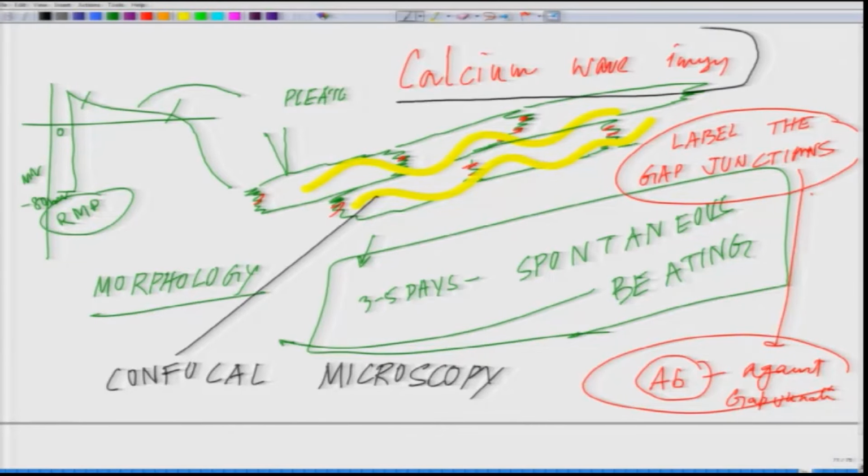So, measuring the calcium wave, these calcium impulses.